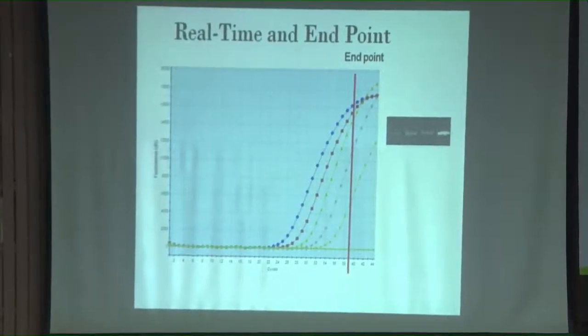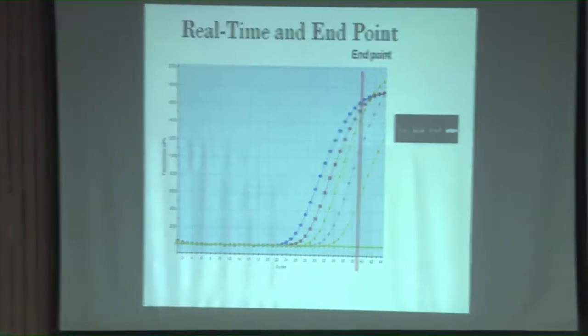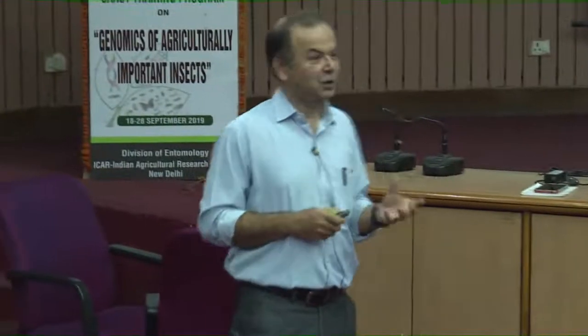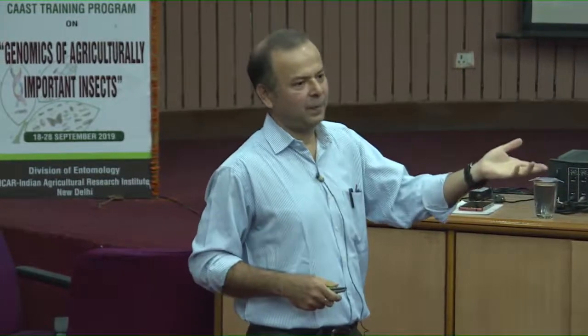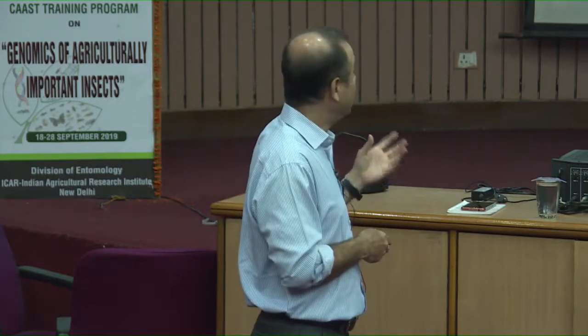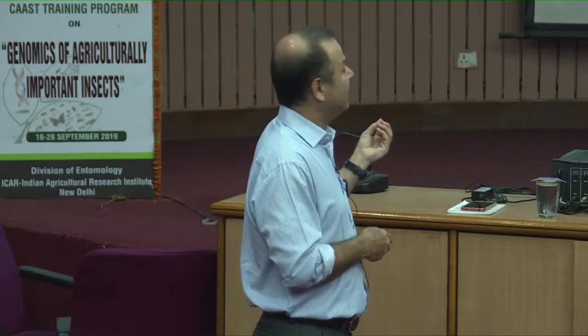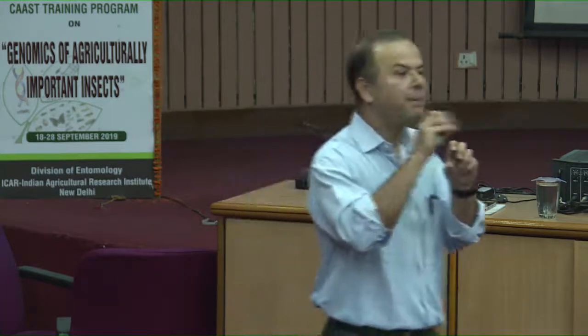But can you say how many fold more? Your eyes cannot say. You can guess that it looks like it is double, it looks like it is 3 times, but that is not acceptable, because science cannot go by individual perception. You need to have data. So, here the machine can read the intensity of this product, how much fluorescence is there. The machine can tell you that okay, here the value is this, here the value is this. So, the machine will tell you that this band in the agarose gel is actually 4.5x of this, meaning it is 4.5 times. The machine gives you empirical data, and then it is believable. You say okay, fine.